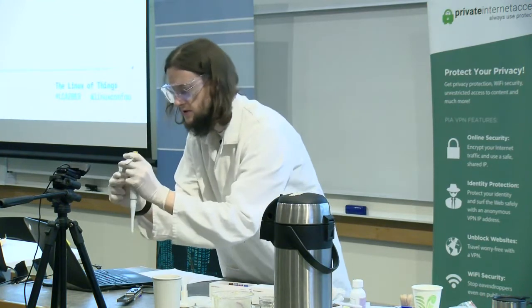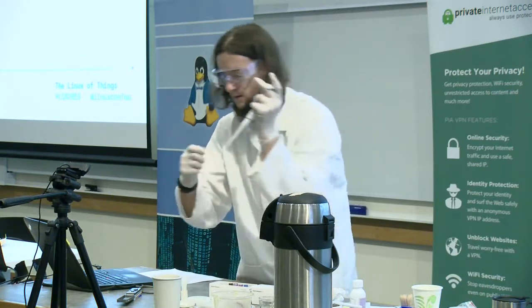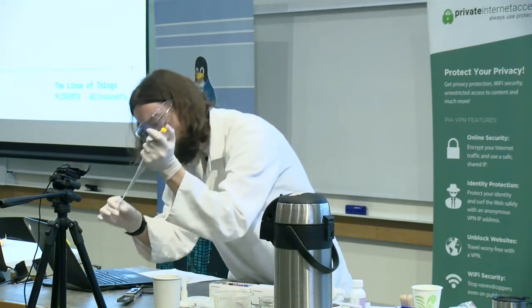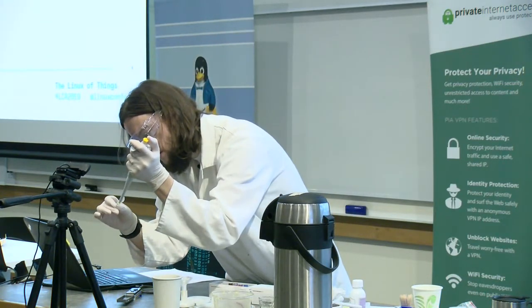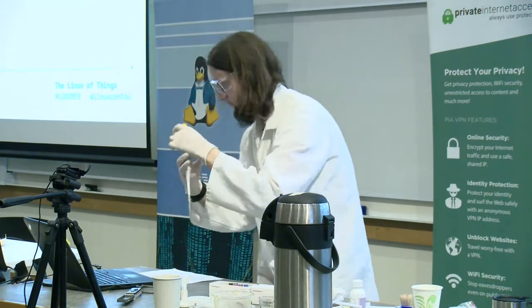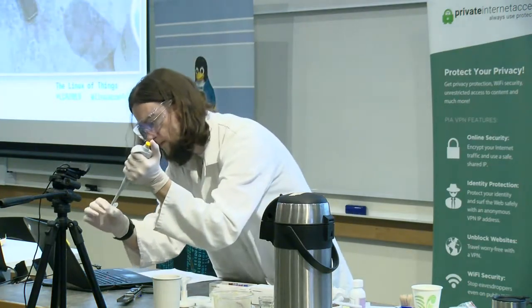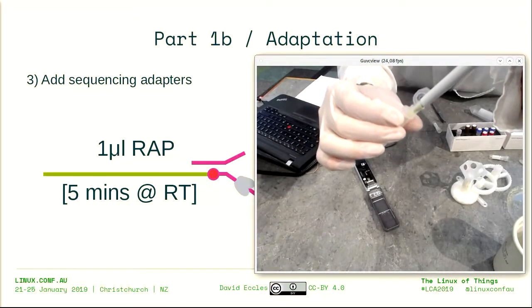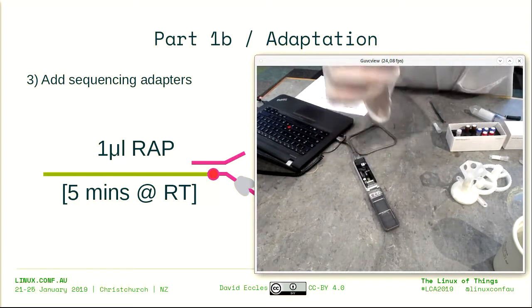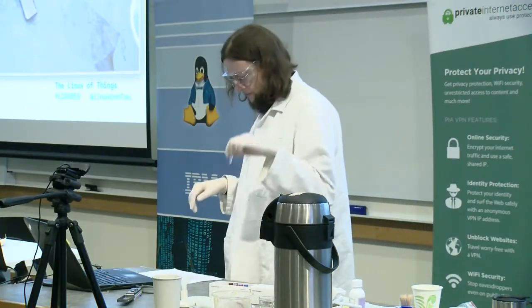Okay, there's stuff in this pipette. Now, this... thank you. This needs to rest for about 5 minutes.